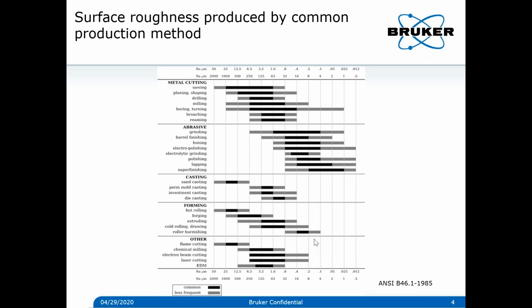Okay. The next question is, I think, from the same audience asking about leveling. Leveling after scanning sometimes gives erroneous results. Please suggest some guideline for leveling. Yeah, I think this may be a big topic that Dr. Ashar can elaborate on, but we can certainly contact this audience later. So, if you are not selecting the proper area for the leveling, then it can result in some error, especially if the leveling surface itself has large variations. Then you need to be very careful about which area you are going to do the leveling on. But this is going to be a detailed topic, so it may not be covered at the moment. Yeah.